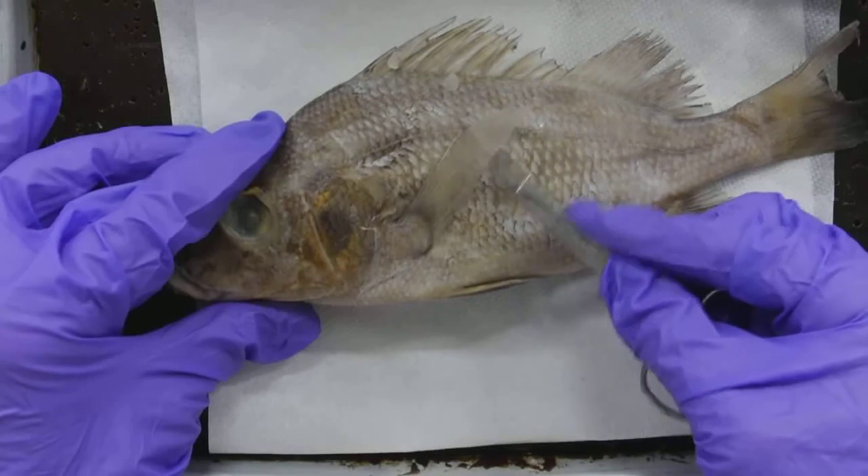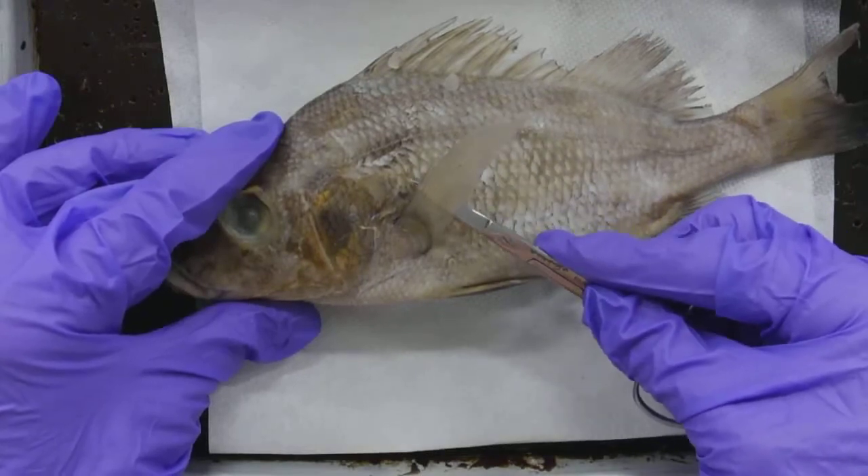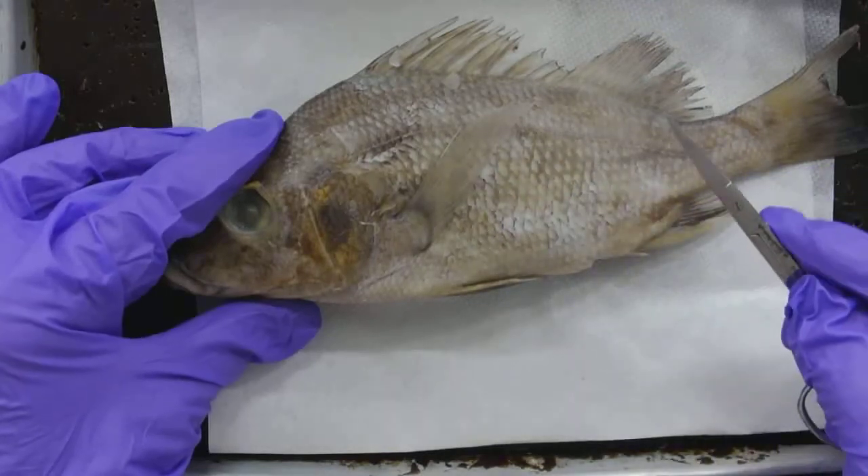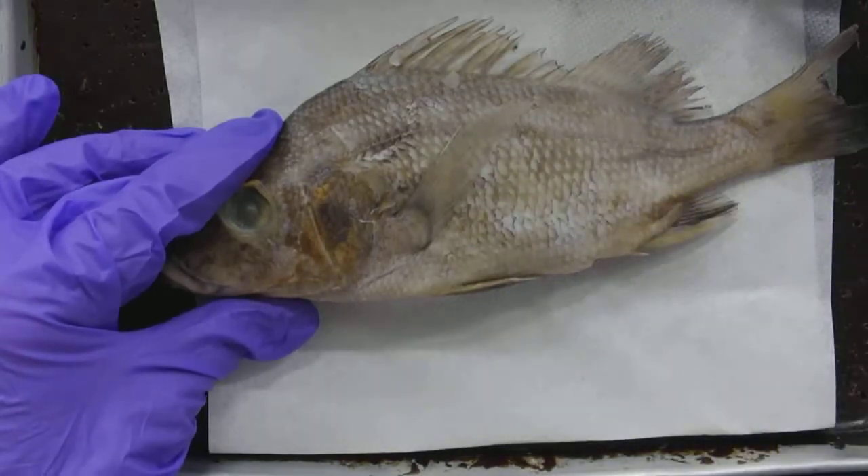I might have to remove the pectoral fin to get a clear view of the internal organs. So I'm going to do that incision and then come back and show you what it looks like.